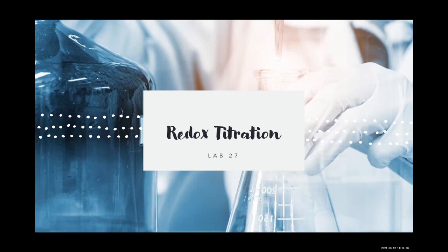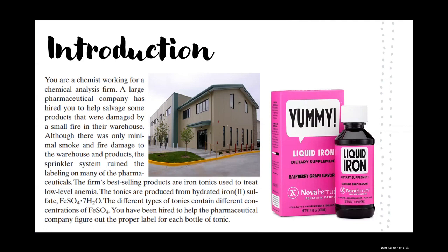27, Redox Titration. Introduction. You are a chemist working for a chemical analysis firm. A large pharmaceutical company has hired you to help salvage some products that were damaged by a small fire in their warehouse. Although there was only minimal smoke and fire damage to the warehouse and products, the sprinkler system ruined the labeling on many of the pharmaceuticals.